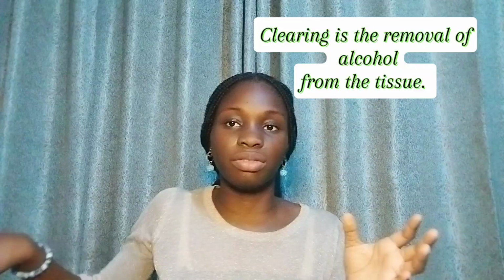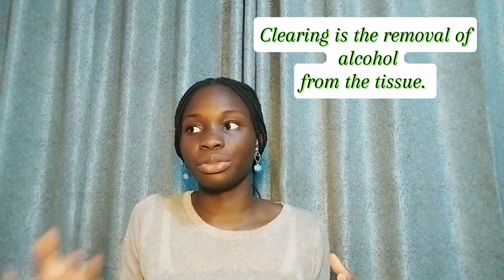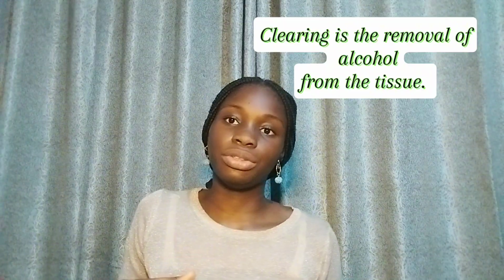Now alcohol is sort of like a use and dump type of thing, because the next step is called clearing, and clearing just means the removal of the alcohol from the tissue. So you use the alcohol to dry it out. Now you have to remove the alcohol. And how do you do that?